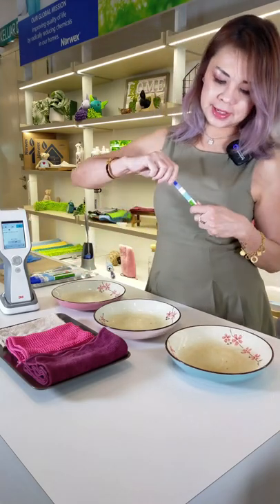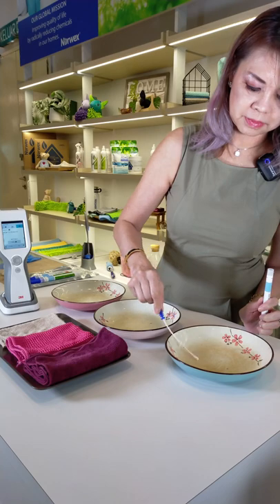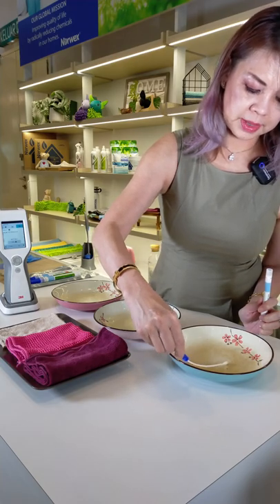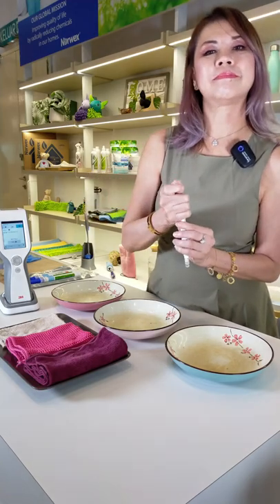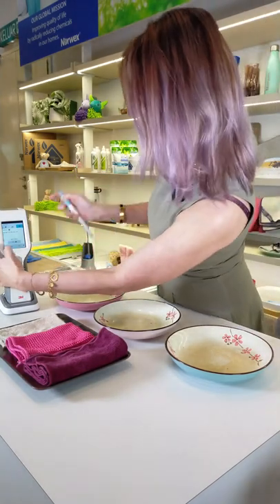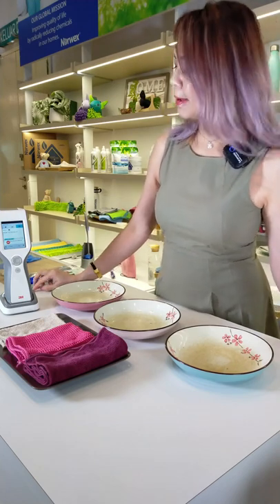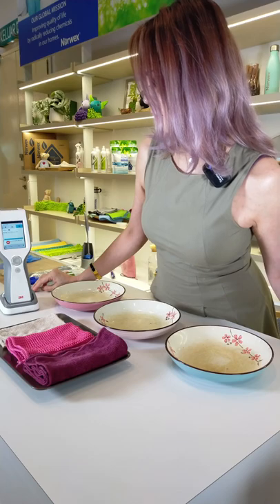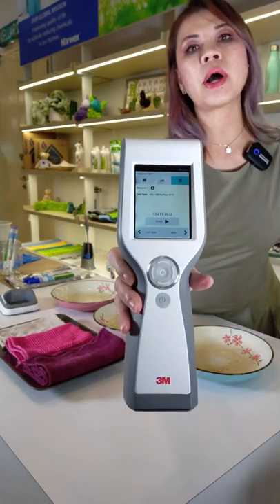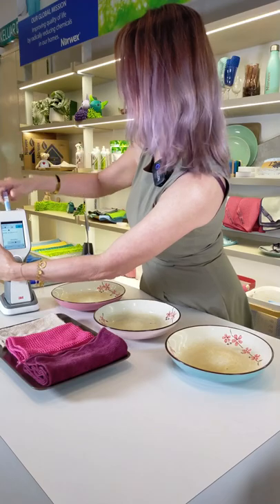And now for the third plate. This one has 10,419 RLU — never mind. A lot depends on how much food we spread on each plate. It doesn't matter; we'll still proceed with our test.